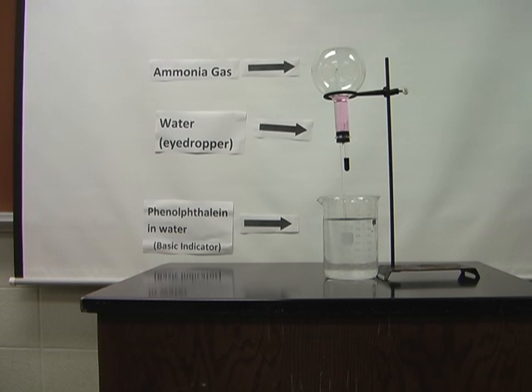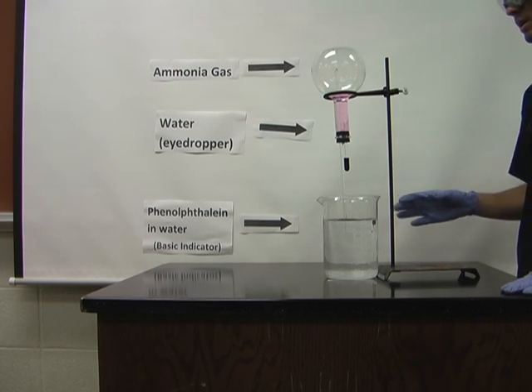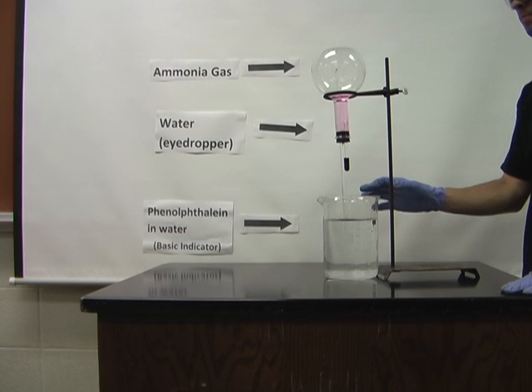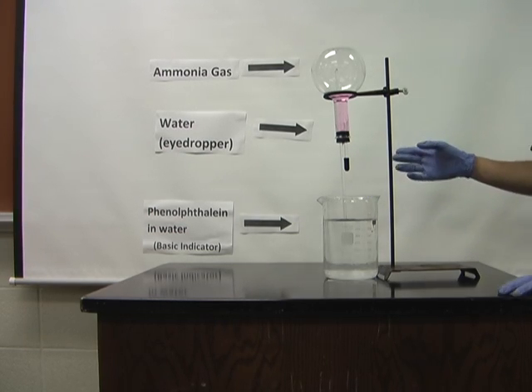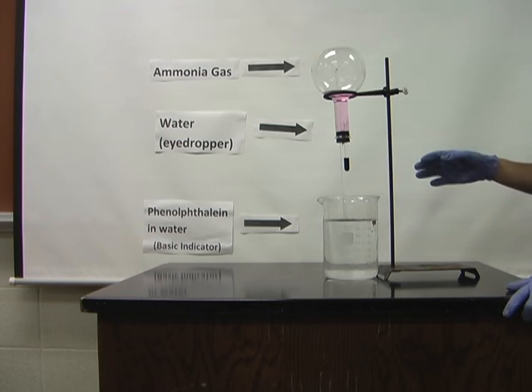happens. As you can see, the flask is filling with water and the water is turning pink. What is happening is when I squirt the water into the flask, the ammonia gas is very hygroscopic, meaning it dissolves in water easily.